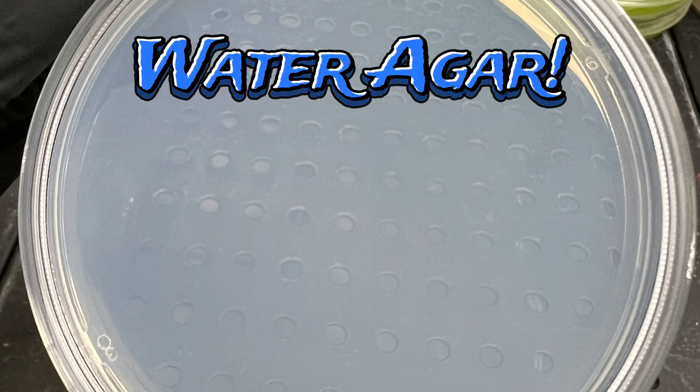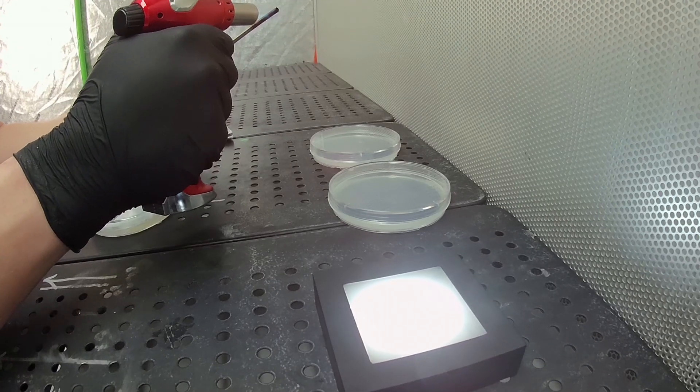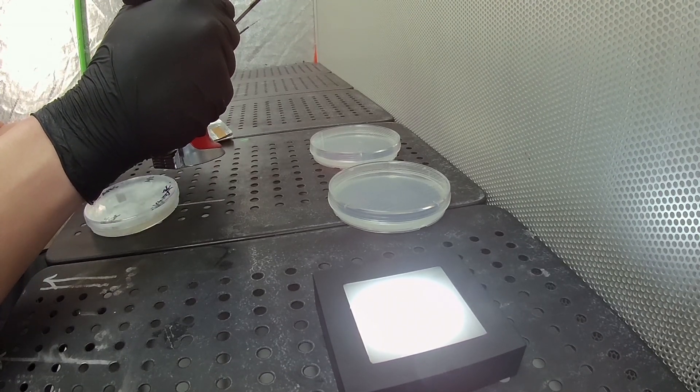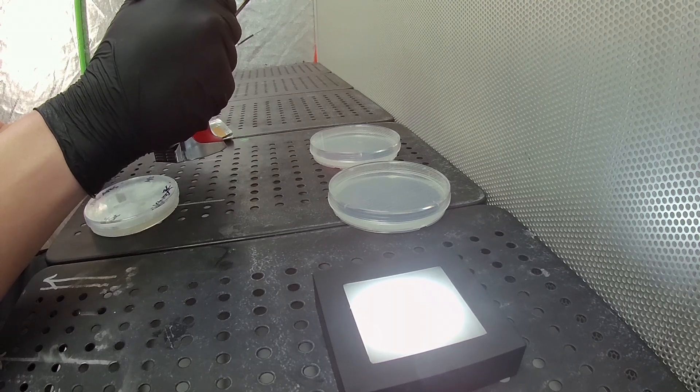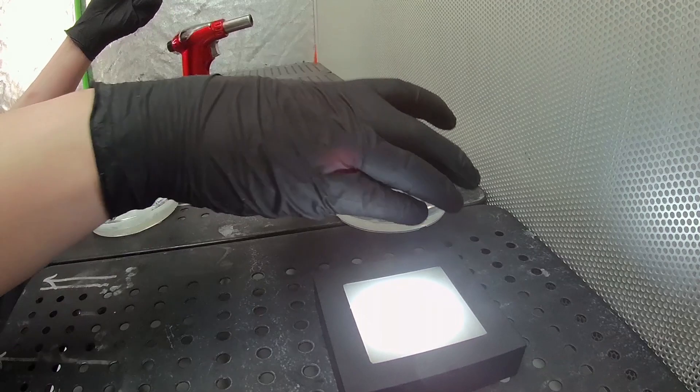Now we'll go into a couple of different methods: trenching and cabin sequestering. Both of which are not always necessary, but if you need to step it up and really clean up that culture, it's a great way to go. In most cases you can just take a small tissue sample, put it on water agar, and it will run away from the bacteria — and that's all you need. But we'll go over these two methods so you can get a better idea of what we've got going on.